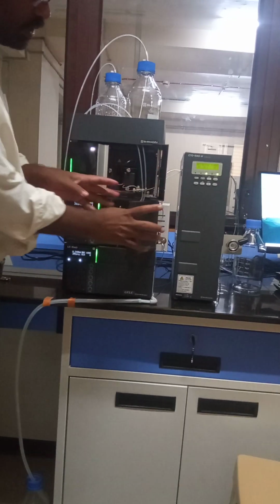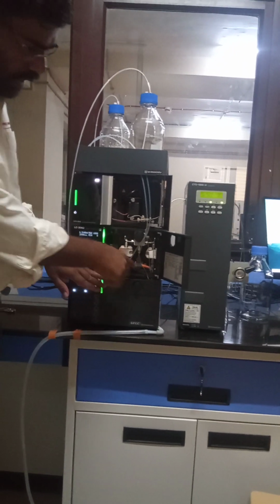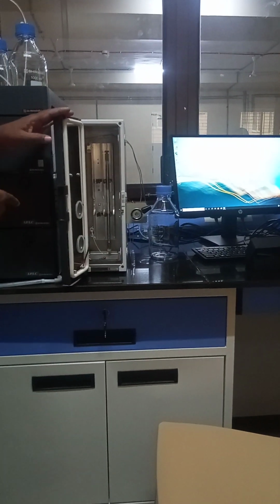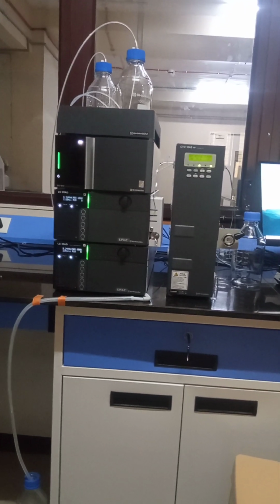For example, all modules means there are leak sensors in each module. Just look one time for any leakage, any flow of water coming outside. Here also leak sensors are there. Okay, up to this level the hardware side is sufficient.